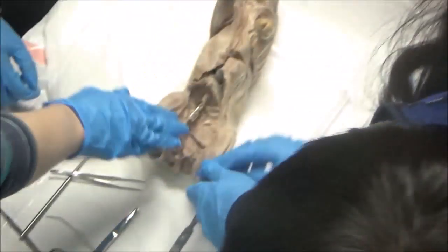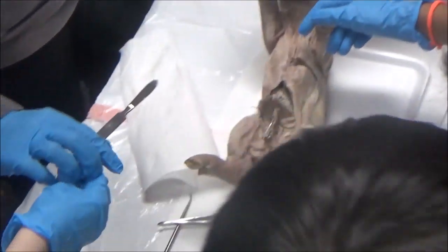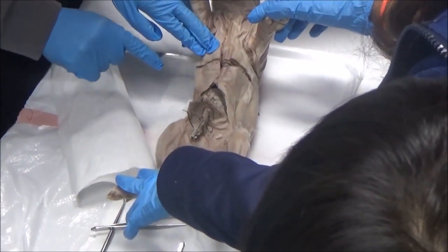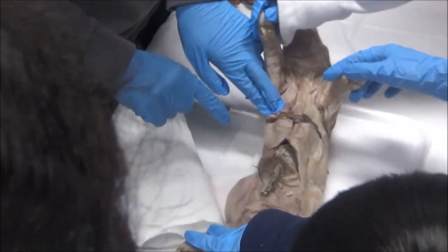Okay, so now we need somebody to carefully chop through here. Who has not had enough slicing experience? Who wants to? Jeff. Okay. That's why I don't cut — it's not a knife, it's a scalpel. Anya broke the scalpel during the flower dissection. How do you dissect a flower? You just cut it.